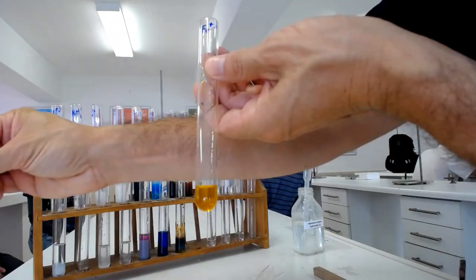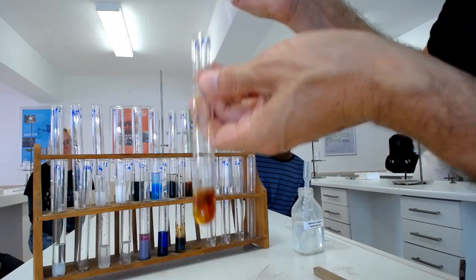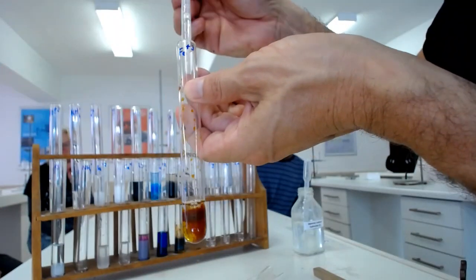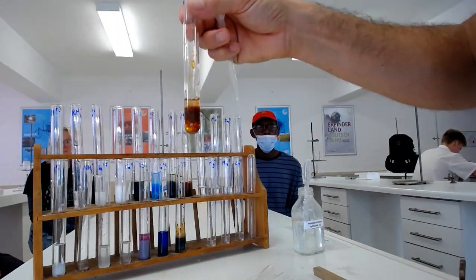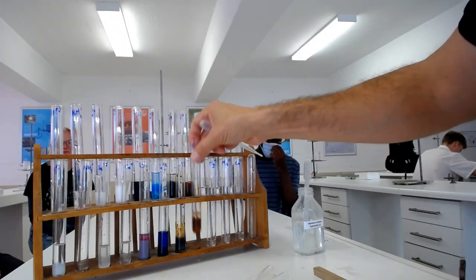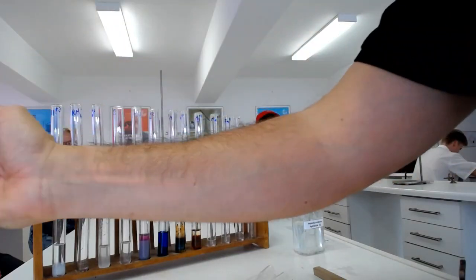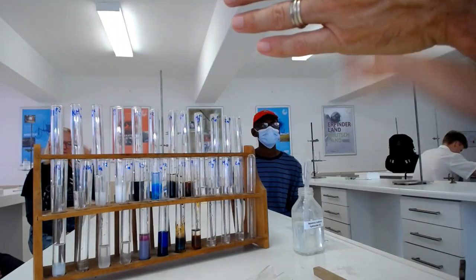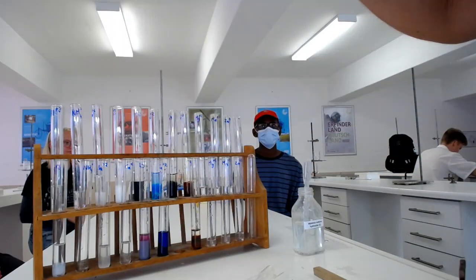Iron 3, also a red-brown precipitate. Is there something that happens if I add it in excess? It just stays my red-brown precipitate. Very nice. So it's already in its oxidized state of +3. So this is what can happen to iron. Iron +2, iron +3.